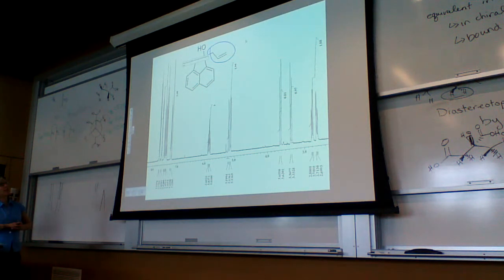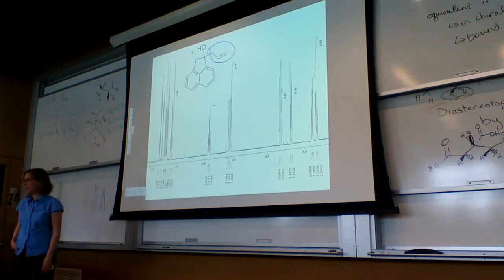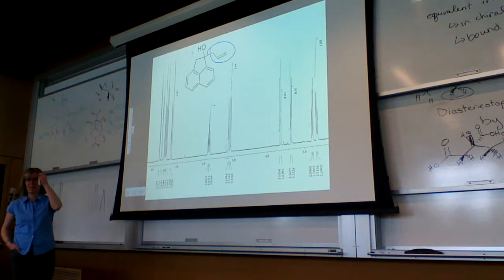With this molecule, we also have a stereocenter, which complicates things a little bit more. So our CH2 group, the two hydrogens are diastereotopic, so they probably are not going to show up in the same area. So we're going to get extra splitting from those.